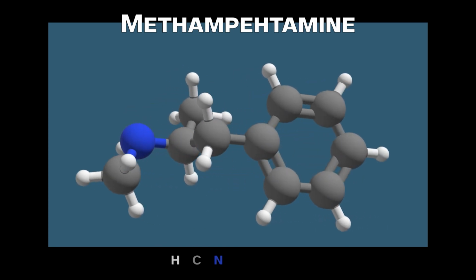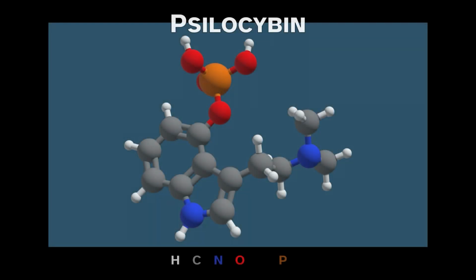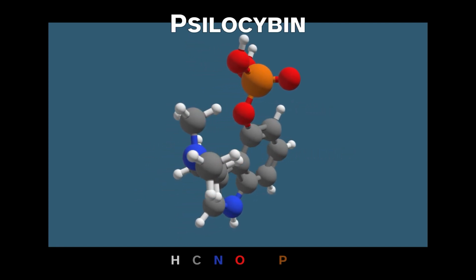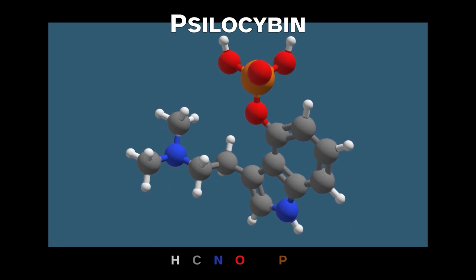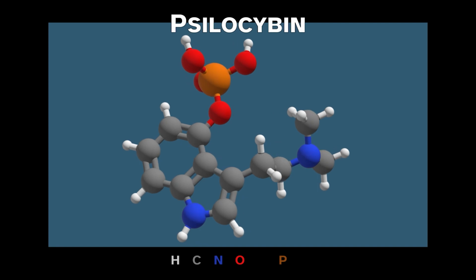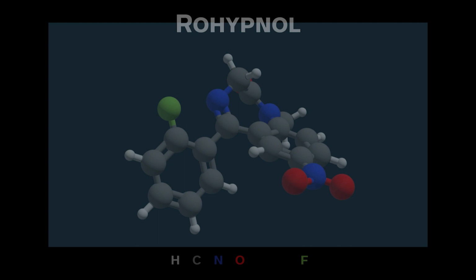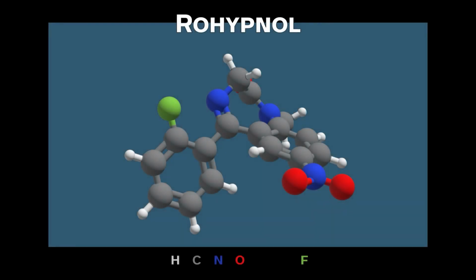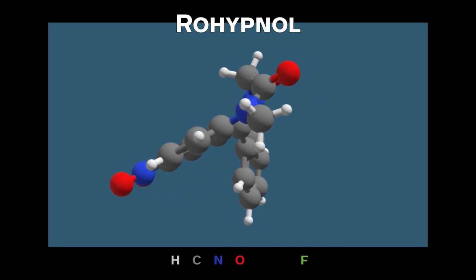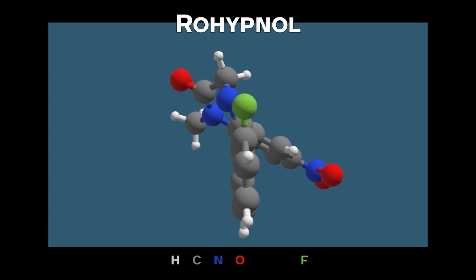The other issue to note, which can be a plus or a minus, is that the UV detector is the default detector for HPLC. For the most part, this requires that the compound to be detected must absorb in the UV region of the spectrum. This, for the most part, requires that the molecular structure of the component to be detected have conjugated pi systems. So look for those features in the molecules we present. Most will be large labile molecules with a benzene-like ring and subsequent conjugated pi systems. Drugs like cocaine, ketamine, methamphetamine, psilocybin, and rohypnol.